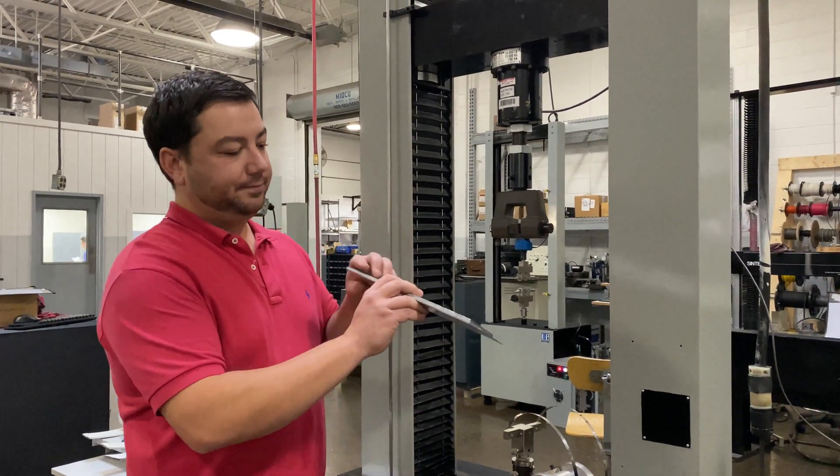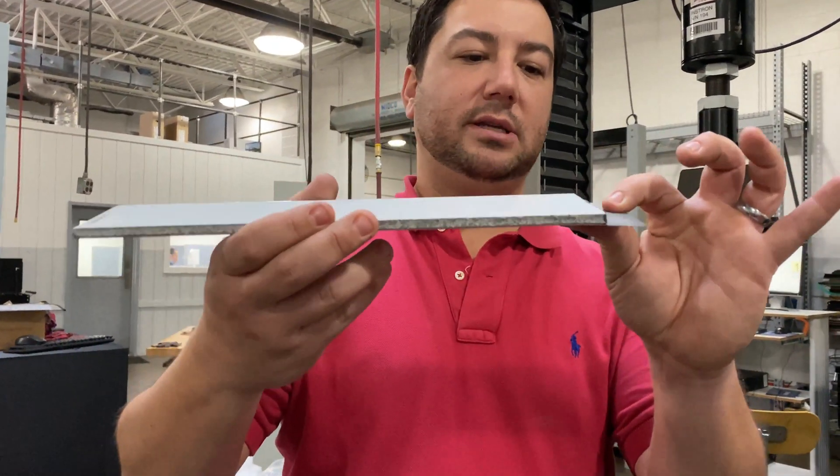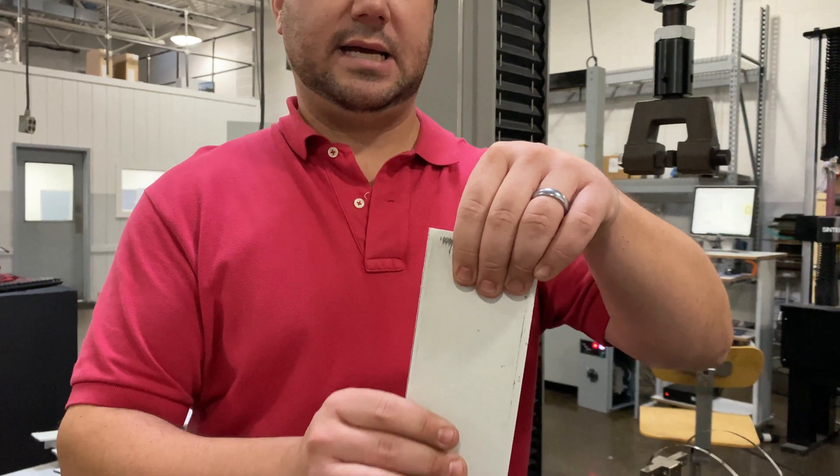We have our specimen here. The drum peel is going to clamp on the laminate material — in this case, a thin sheet metal — and the insulated material on the backing is what the grip will take care of on the top.